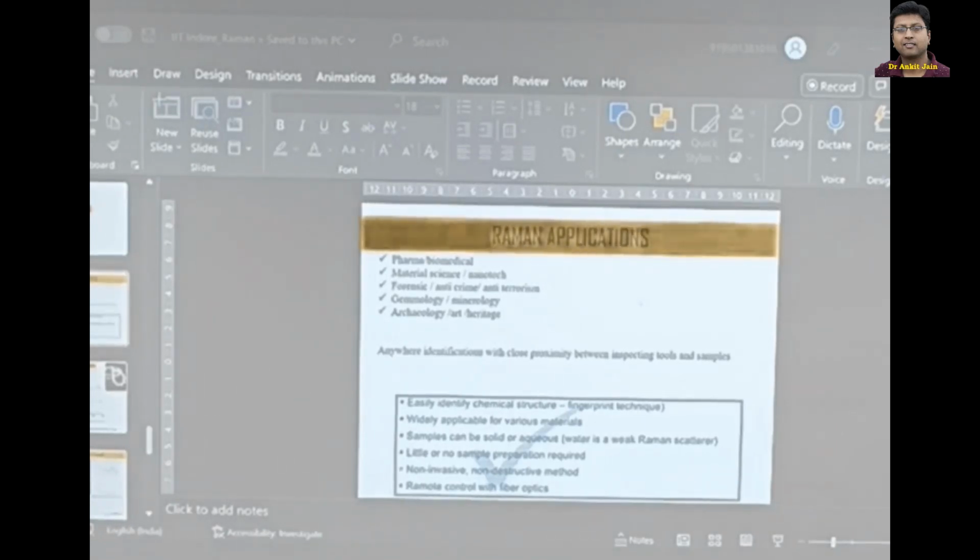See, I told you one thing: you can play with the laser wavelength and laser intensity depending upon what kind of response you are looking for. If something is burning your enzyme, then don't use that wavelength, use a different one. Higher frequency means higher energy, because energy is h nu. Higher wavelengths mean lower energies, hc by lambda. So if you start with 1064, your enzymes will not burn, and you can do Raman spectroscopy using 1064. But then you can go down.